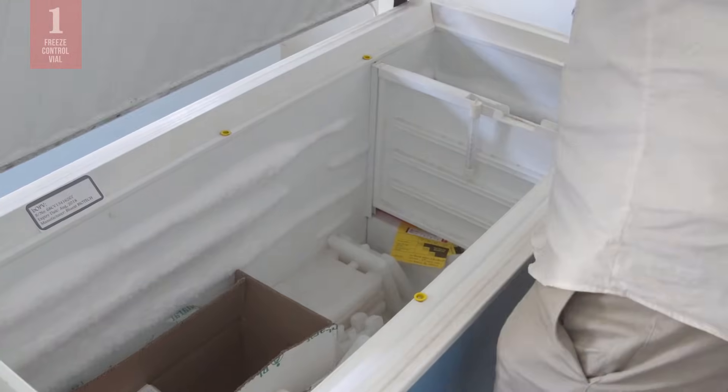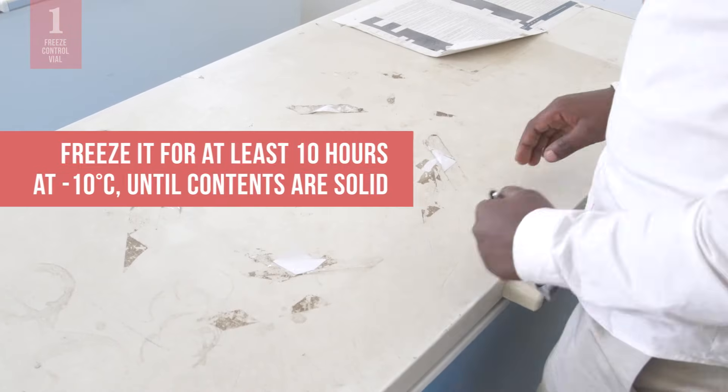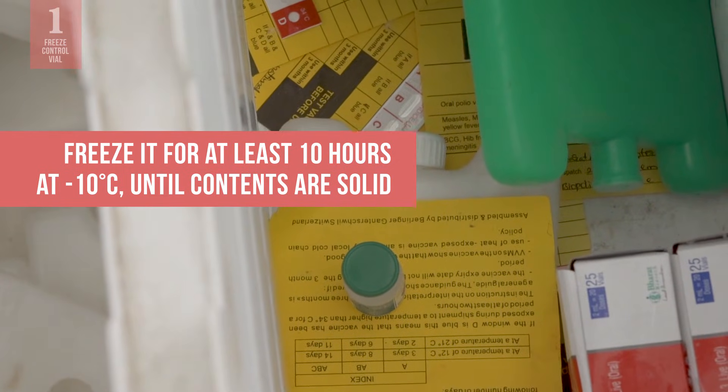Place the vial in a freezer or the freezing compartment of a refrigerator. Leave overnight or at least 10 hours at negative 10 degrees Celsius until the contents are completely solid.